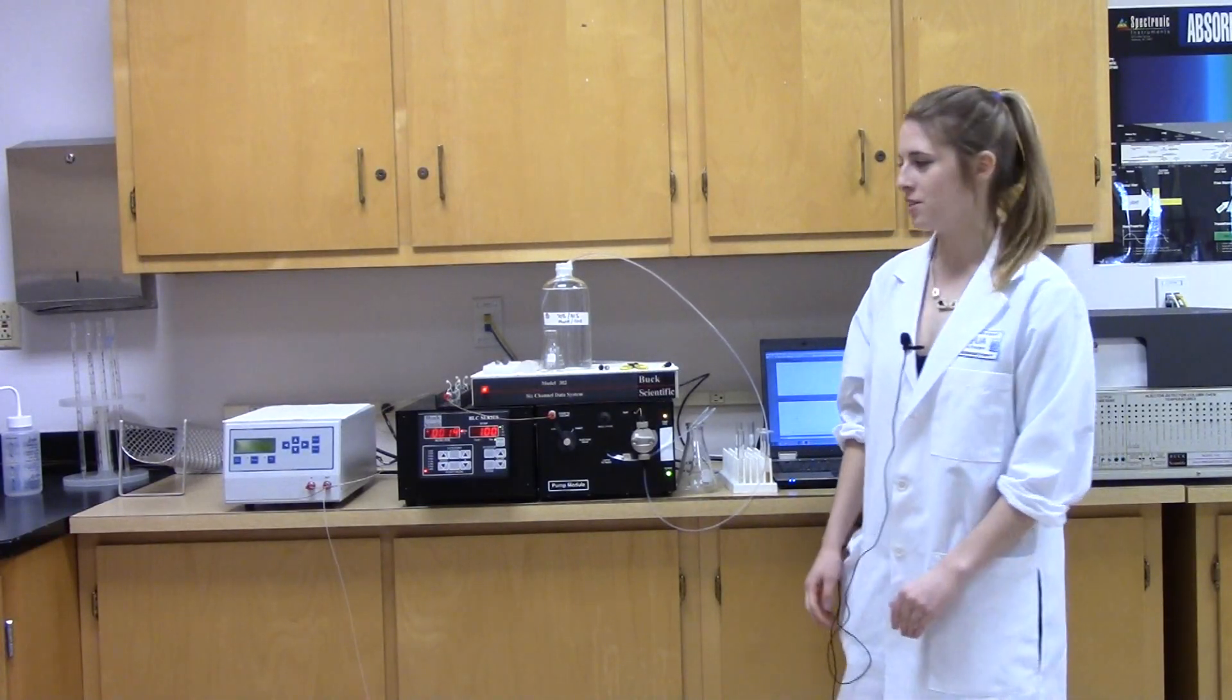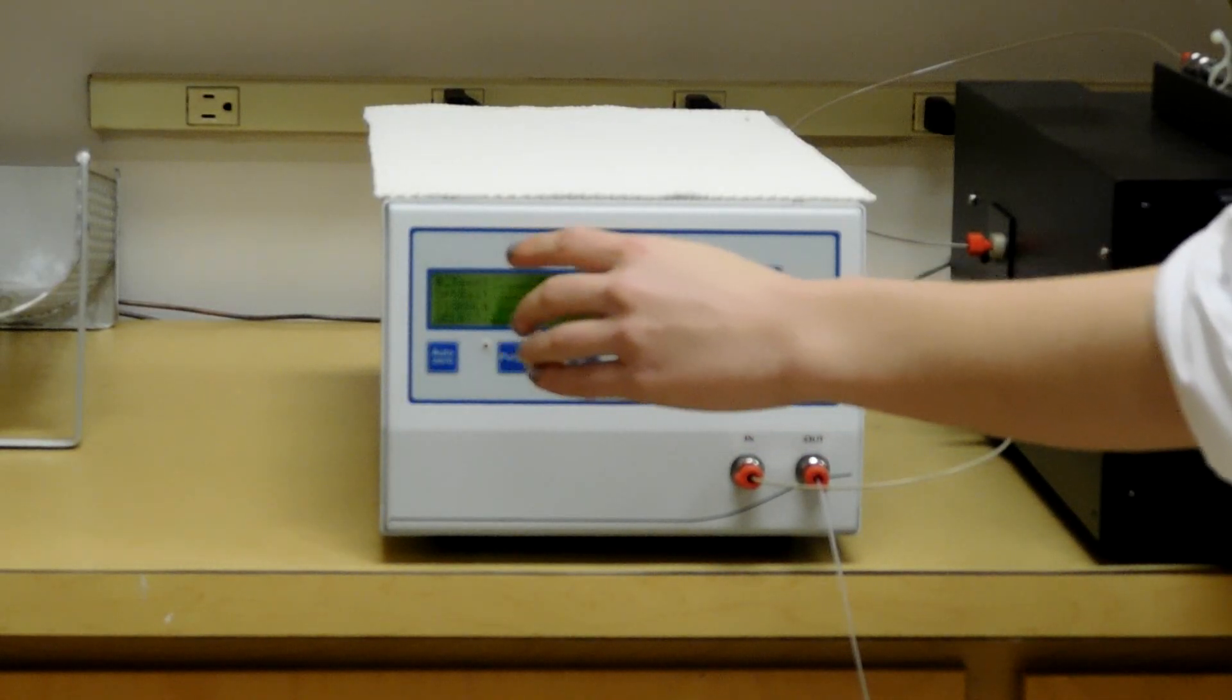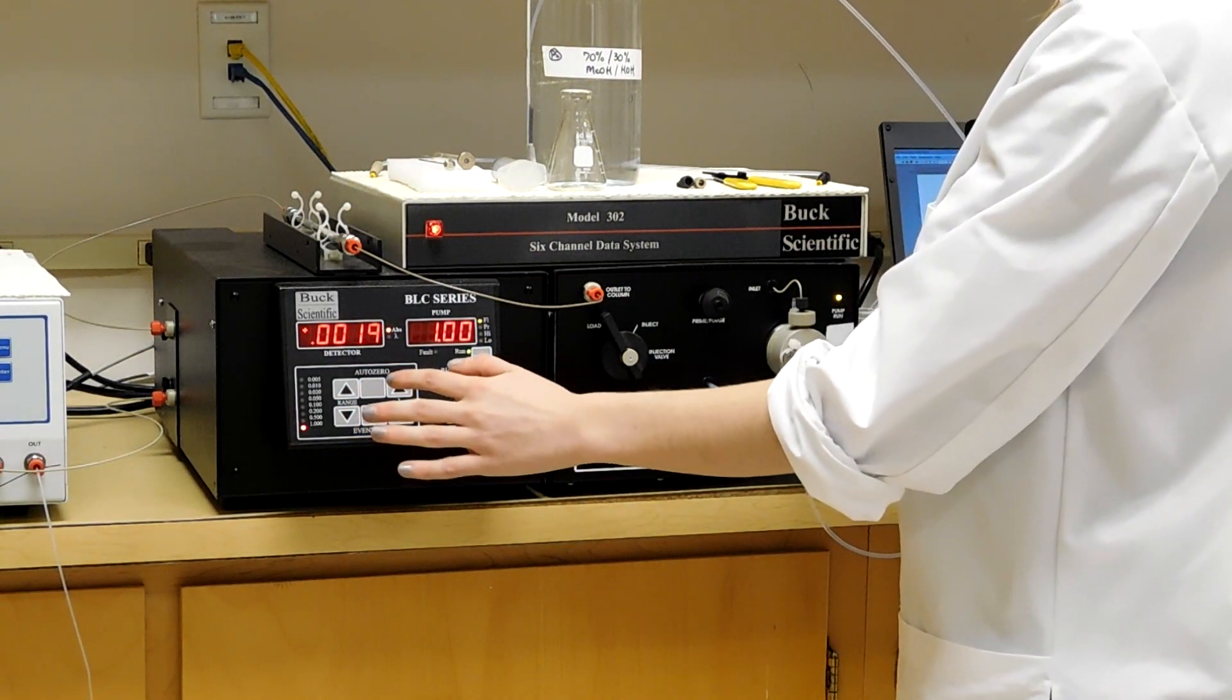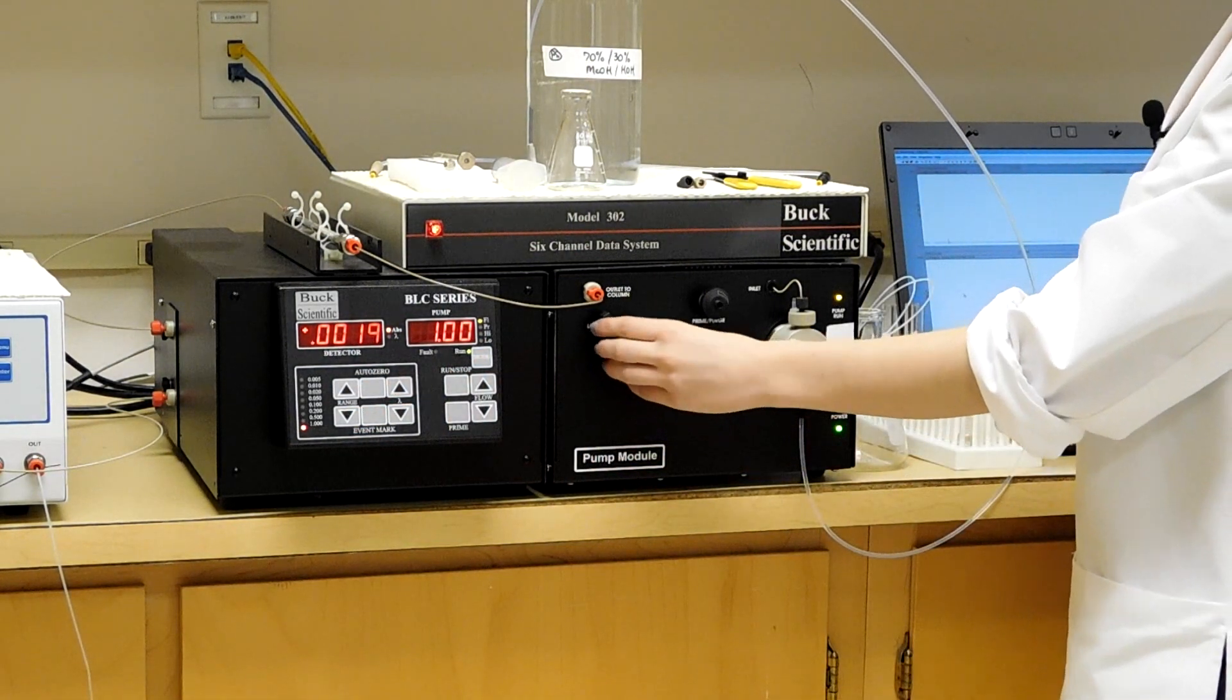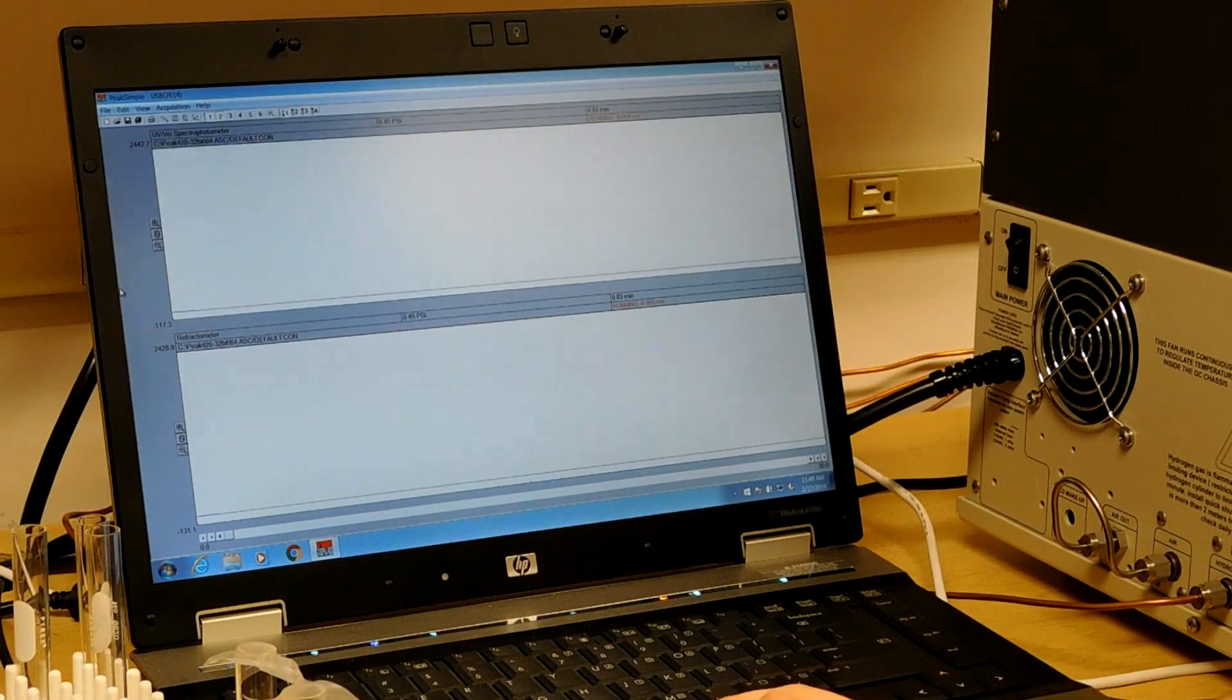In order to do this, you go over to the first box, you press auto zero, go to the second box, and you hit auto zero. You switch the load position to the inject position, and you go over to the computer, and hit auto zero, and auto zero. It's the zero button in between the magnifying glasses.